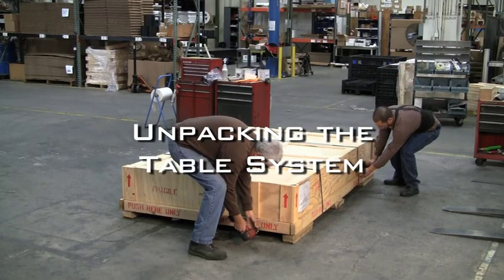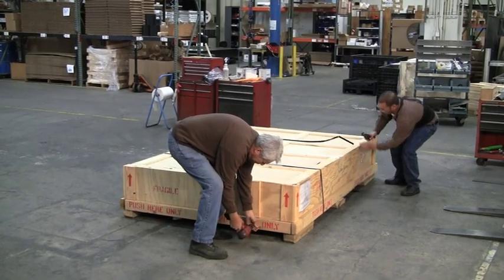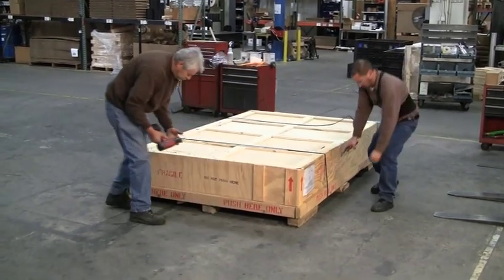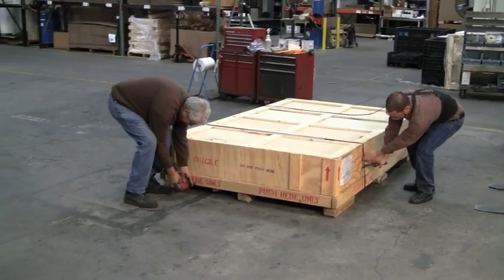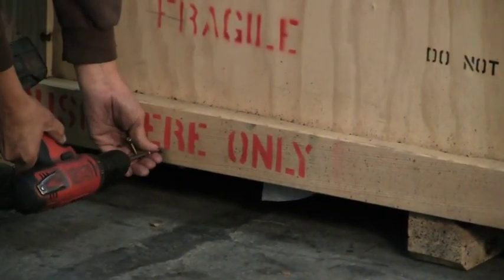Unpacking the Table System. Optical table crates are constructed of a bottom skid and reinforced cover bonnet. To remove the top bonnet, use a power tool to remove the fasteners located around the bottom perimeter of the bonnet.